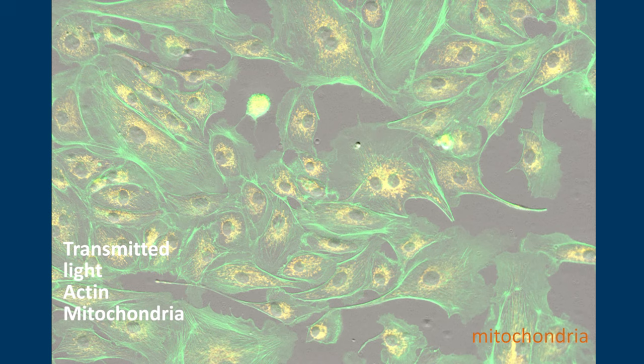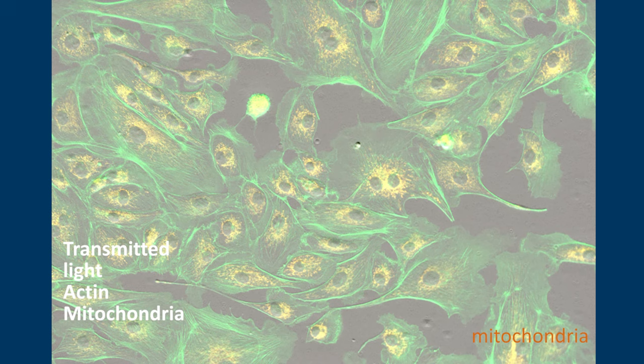So let's put it all together. We'll take a look at our transmitted light image and we'll overlay our actin in green, our mitochondria in orange, and our nucleus in blue.